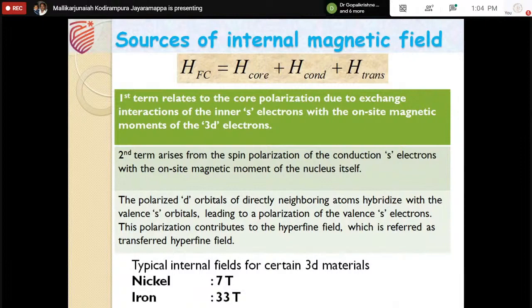Therefore, to make these measurements happen, we need a strong hold on the electronics, and we need to design our electronics to suit measuring NMR at the frequency corresponding to these magnetic fields. Correspondingly, there will be a change in the frequency also. There are advantages and disadvantages.